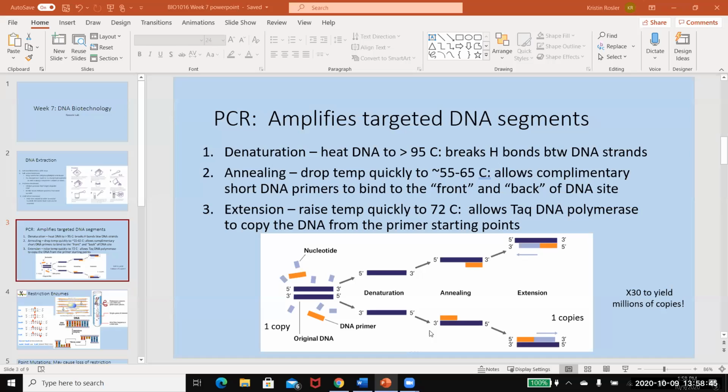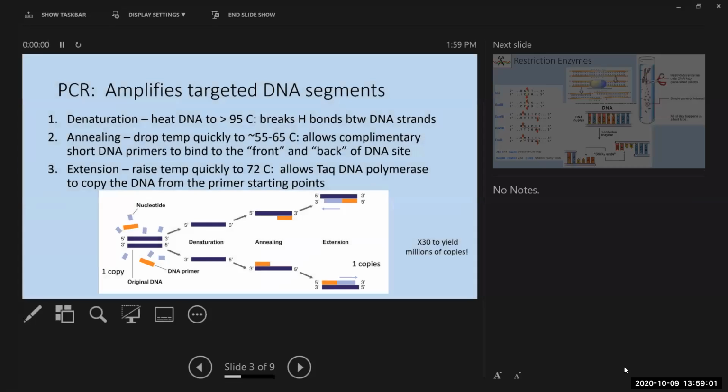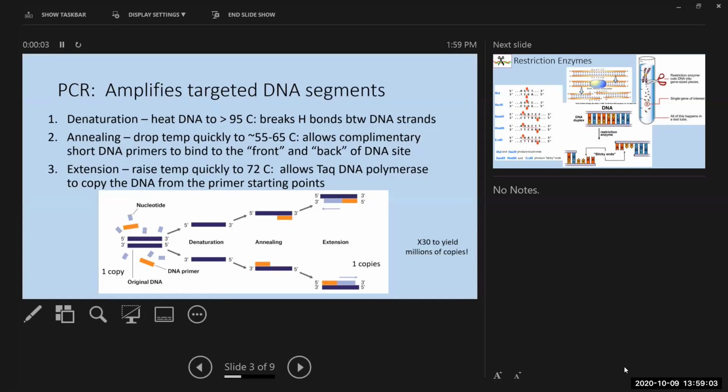So part 2. Now we've extracted the DNA. Let's imagine we did this out of you, with a couple of cheek cells. Now what we want to do is some experiments on that DNA to determine what your genotype is. Firstly, one of the things you do in this scenario is PCR. PCR is commonly used in DNA fingerprinting, and you've probably heard a lot about it. There are certain COVID tests that use PCR amplification to determine whether or not you have the virus.